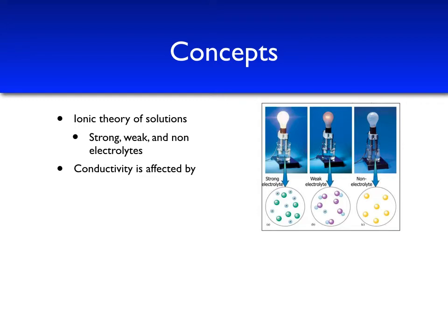The conductivity of a solution is affected by many factors. We'll talk about some of the main ones here that we'll be exploring for this experiment. The first effect is, of course, concentration, or the number of ions in solution. We can predict that if there are more ions in solution, a stronger current will be formed when the voltage is applied, and we'll end up with higher conductivity measurements. We'll get to explore this by looking at different concentrations of sodium chloride solutions and their conductivity measurements, where we can test this hypothesis.